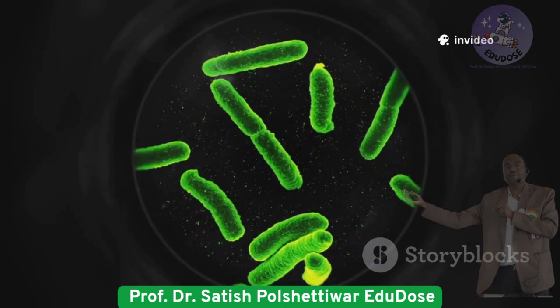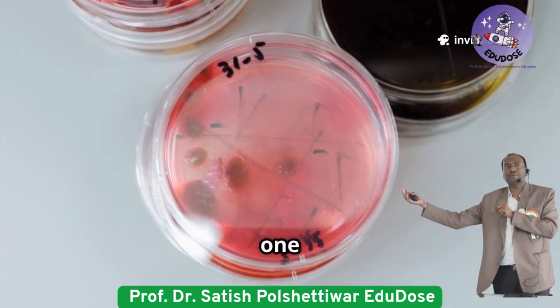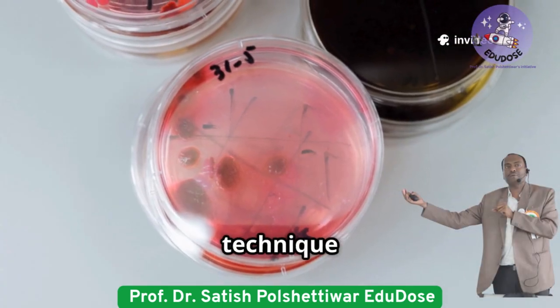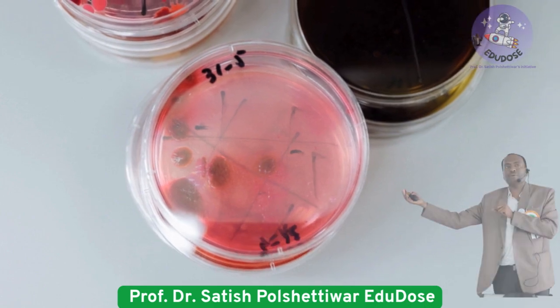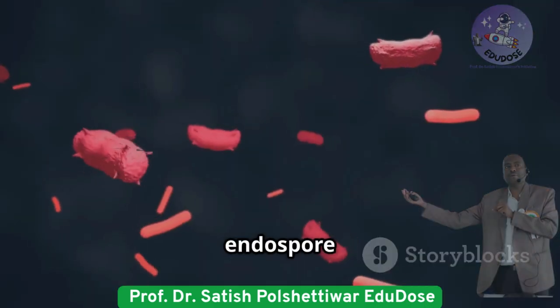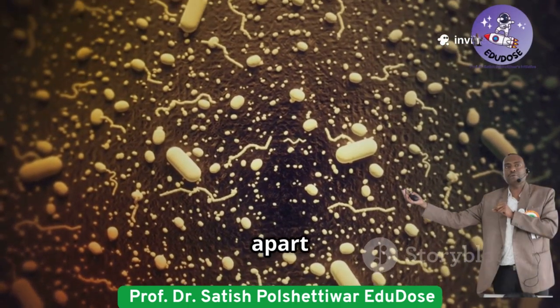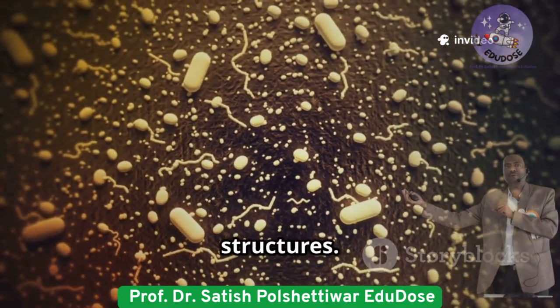much detail. Next up is differential staining. This uses more than one dye, and the most famous technique here is gram staining. Other differential stains include acid-fast, capsule, and endospore staining. The goal? To tell bacteria apart based on their cell walls or special structures.